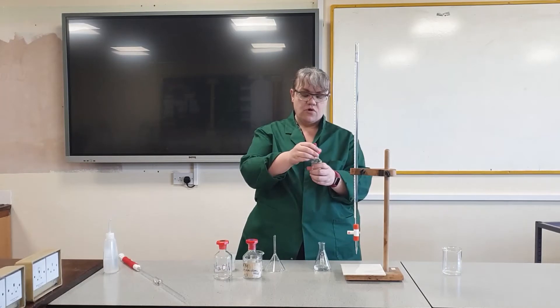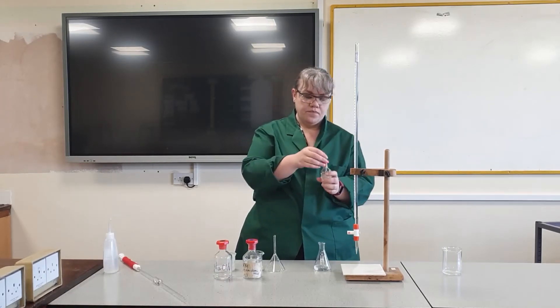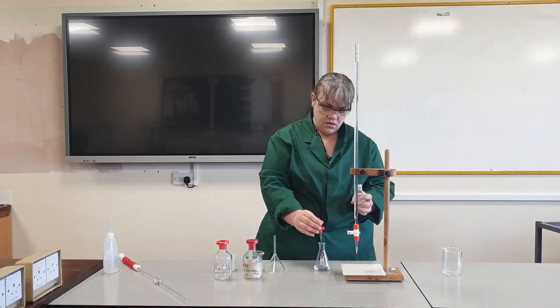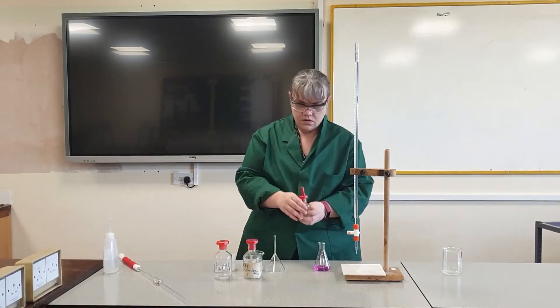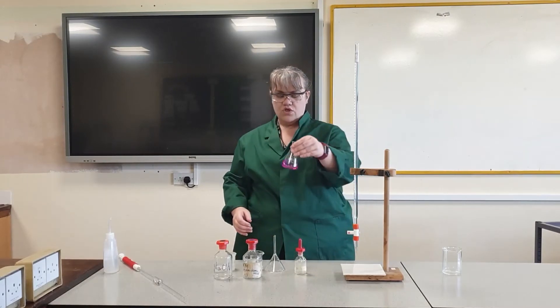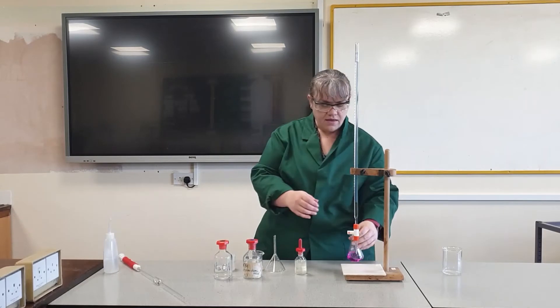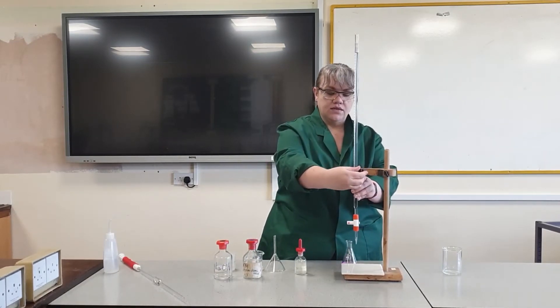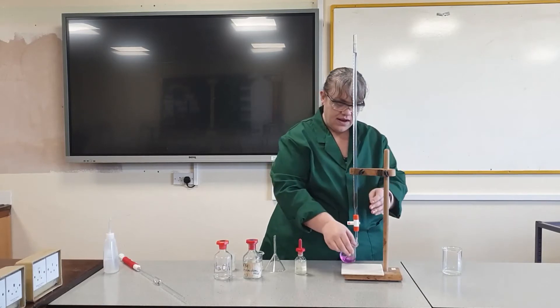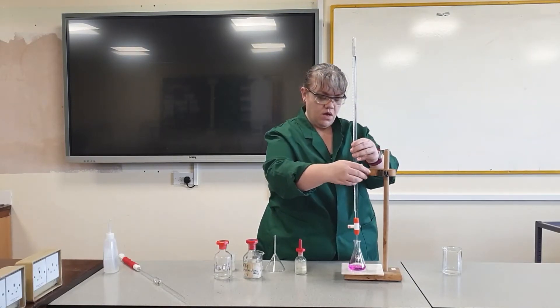Now I'm going to add a couple of drops of indicator. I'm using phenolphthalein, which turns pink in alkali. I'll put that under my burette, with a white tile underneath which will allow me to see the colour change much more clearly.